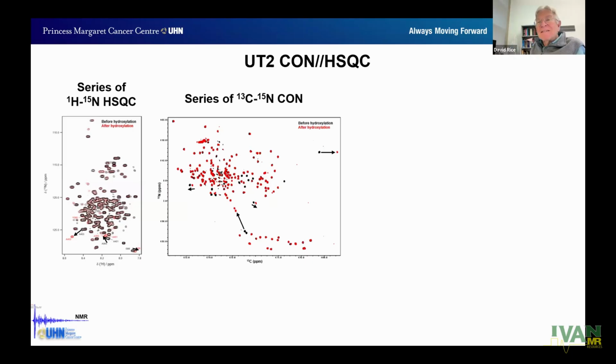Oh, that's maybe not an obvious question to ask. I think you can go pretty high because most of the time you can observe your carbonyls a lot better than anything else. Okay. But how high in molecular weight? I haven't done the huge complexes yet.